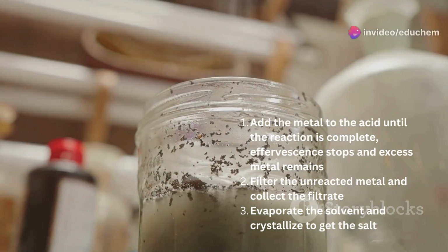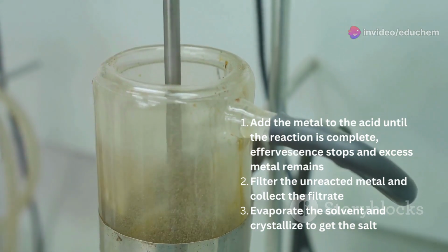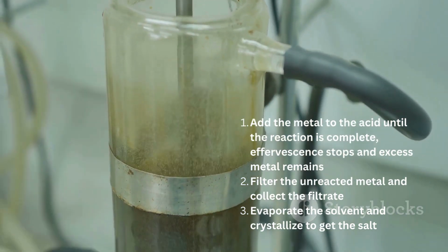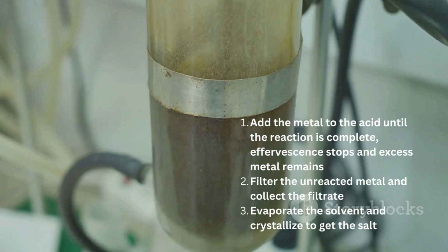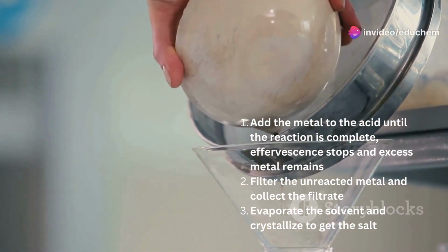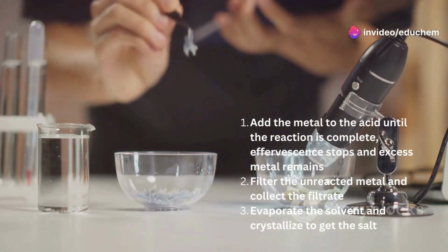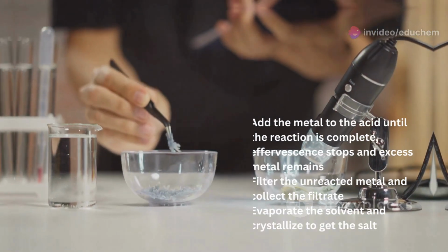Add the metal to the acid in a reaction vessel. Allow the reaction to proceed until the metal is fully dissolved. Continue adding more metal until the reaction stops. There is no more effervescence and excess metal remains. Filter out any unreacted metal and collect the filtrate. Evaporate the solution to crystallize the salt. Dry the crystals to obtain the pure salt.